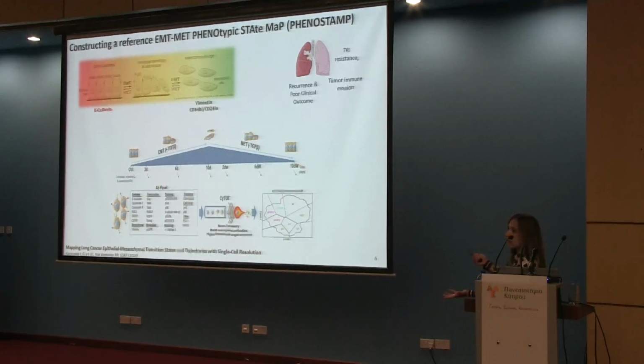So when I was doing this project, I used CyTOF, so I was able to interrogate all these proteins here at the same time. And I used markers that define EMT, survival, signaling, apoptosis to get a better feel of the characteristics of each and every one of these states. So I induced EMT in lung cancer cell lines by treating with TGF-beta, and then I withdrew TGF-beta to induce the reverse, okay?